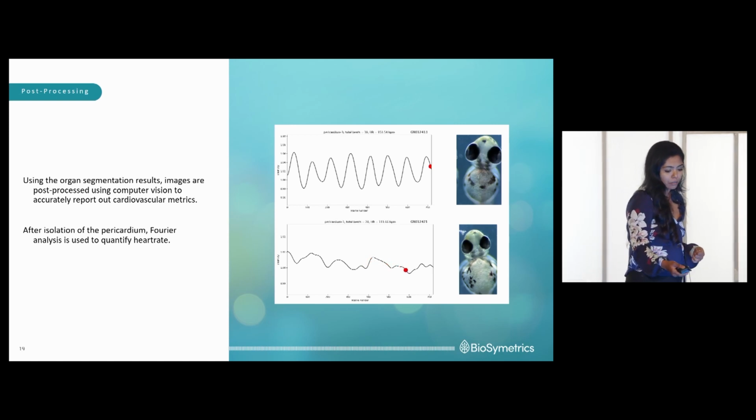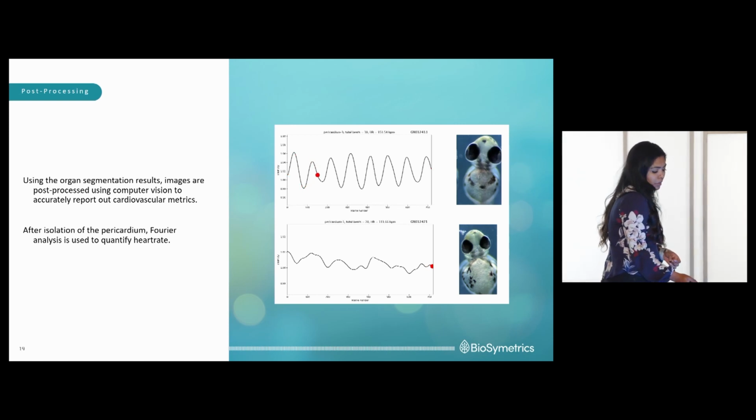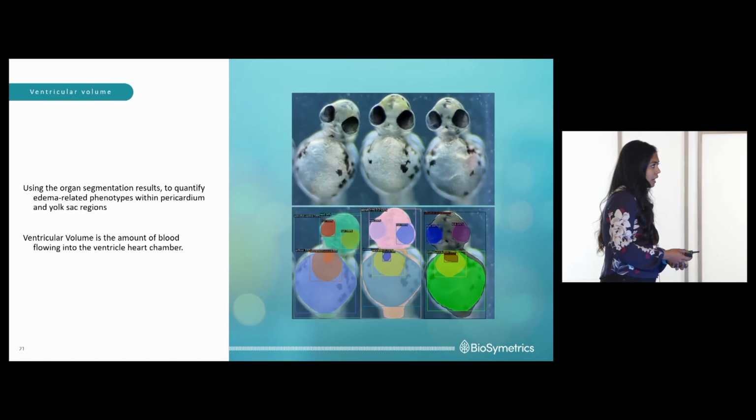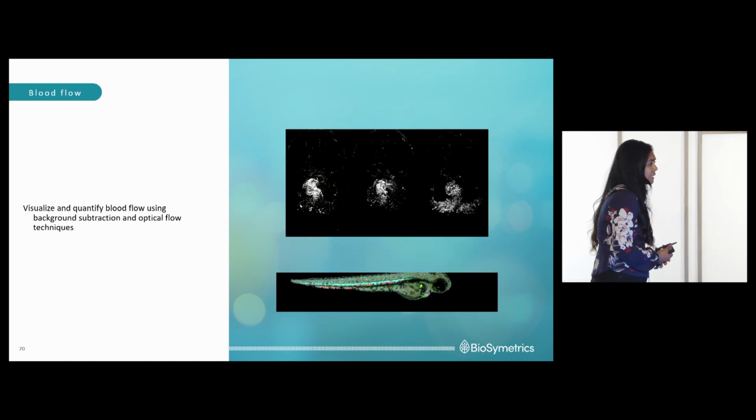So here you have a video of a healthy zebrafish at the very top. And at the bottom, you have a zebrafish with an abnormality, a trembler type of heart rate.